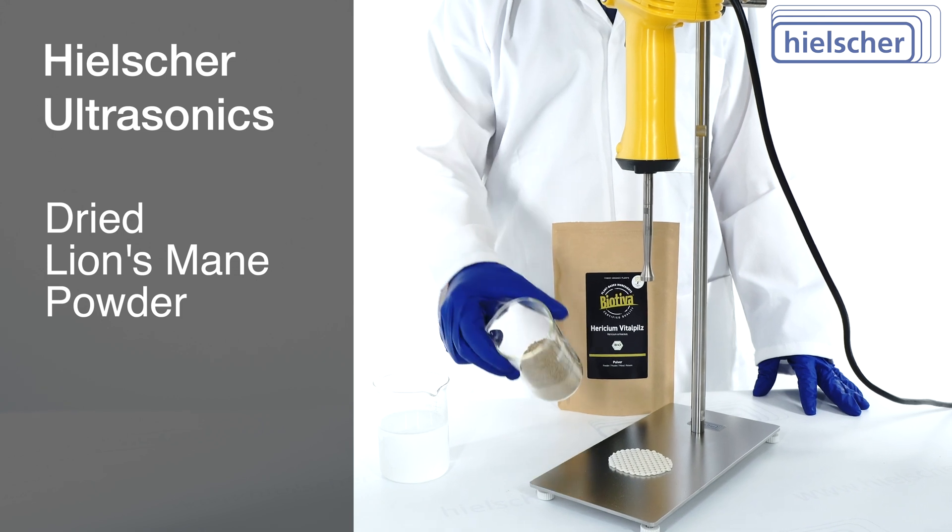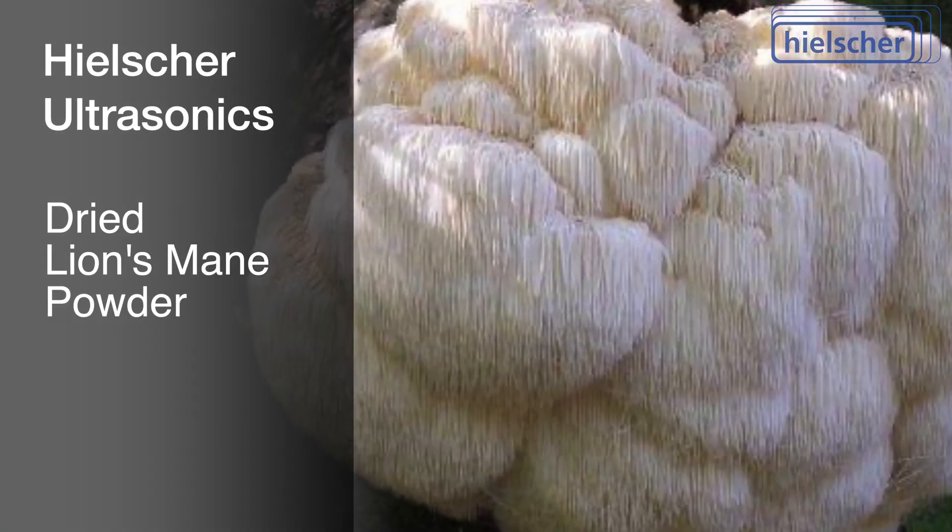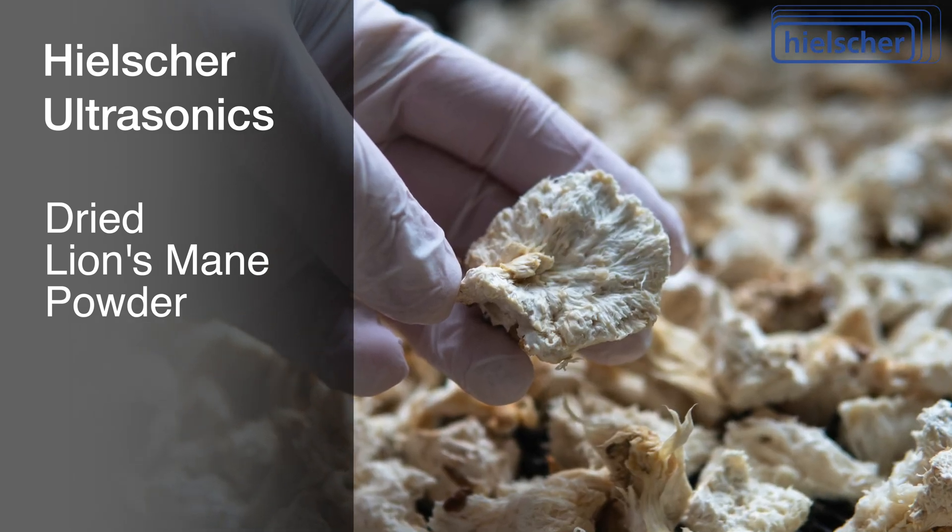For this extraction demonstration, we are using dried lion's mane powder. However, you can also use fresh chopped mushrooms or dried ground mushrooms.